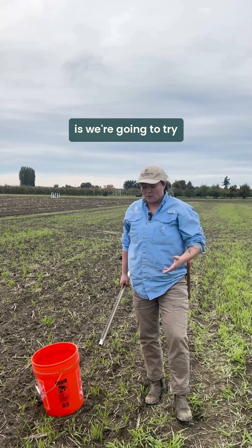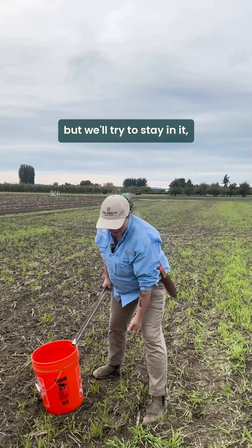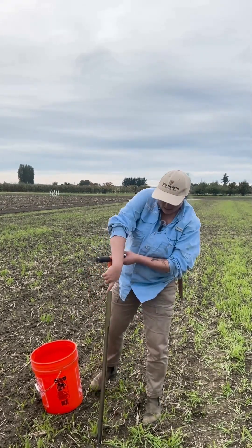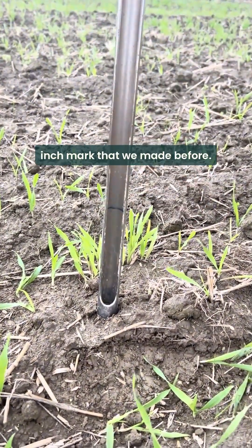The first thing we're going to do is try to find a row. There's not a lot of row here but we'll try to stay in it, and then we're going to move any debris that's at the top. Then we're going to take our probe and push down to that six inch mark that we made before.